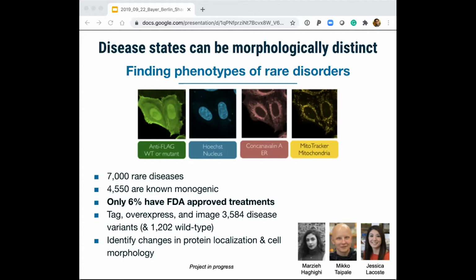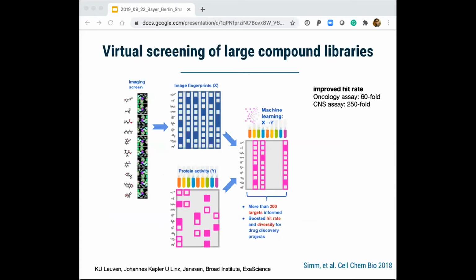In fact, we've already leapfrogged to actually doing the drug screen using the pooled cell painting technology I just described, because that allows us to test out hundreds of alleles against a drug in a single well. There are many other applications of image-based profiling that we've been pursuing, led by our collaborators. I'll just walk you through two of these.